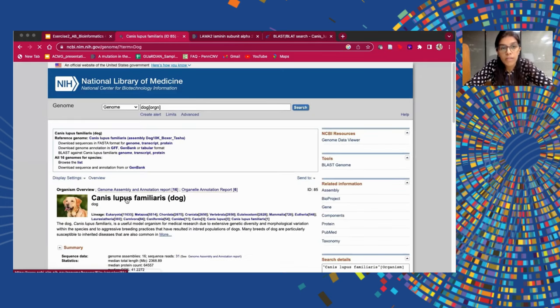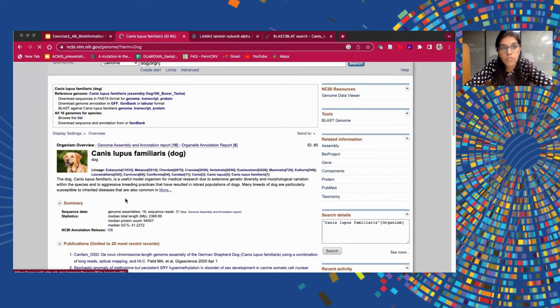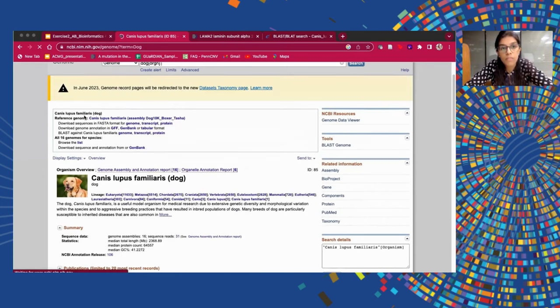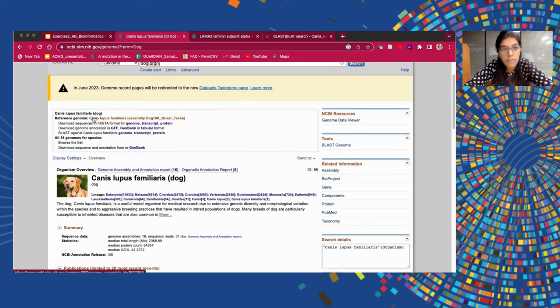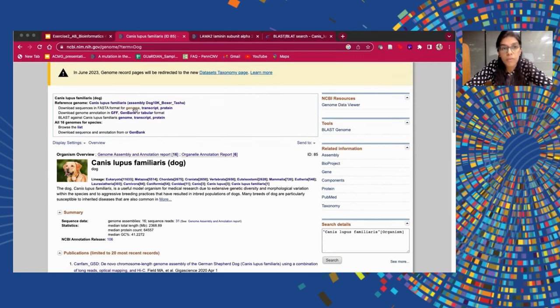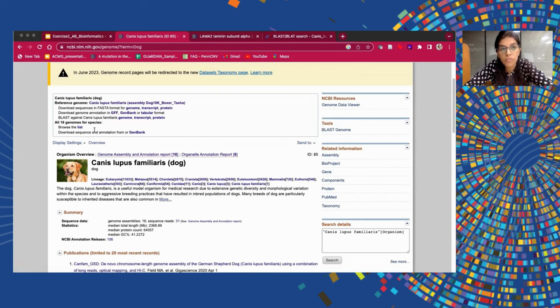Once we press enter, we can see a page which gives us basic details about the organism. The organism of our interest is dog, its scientific name is Canis lupus familiaris, and there is a reference genome already available. If we want to download the entire genome sequence, transcript sequence, or protein sequence of the reference genome, we can.